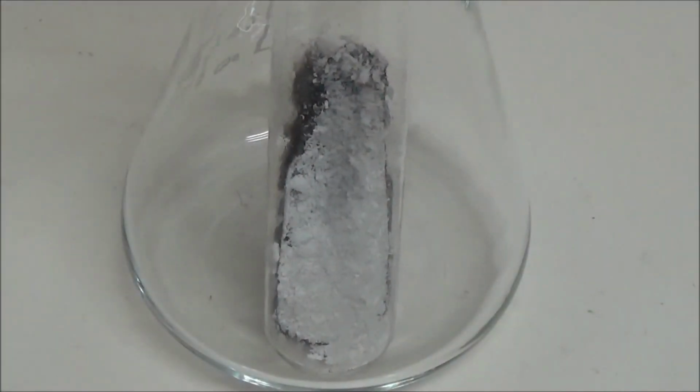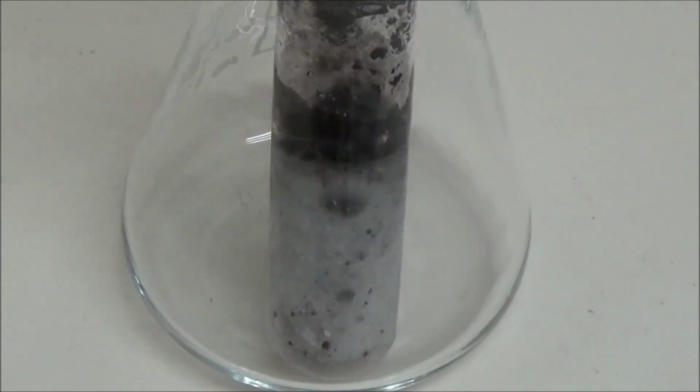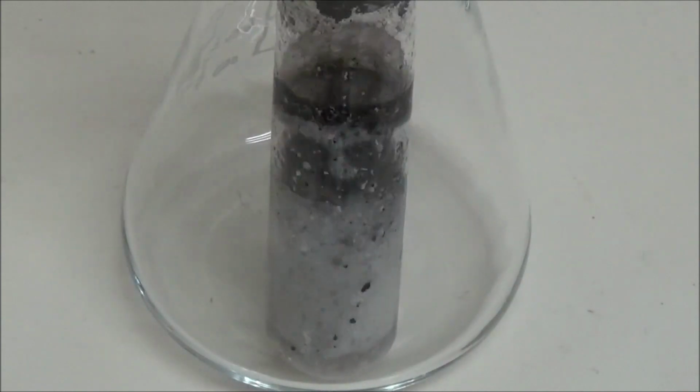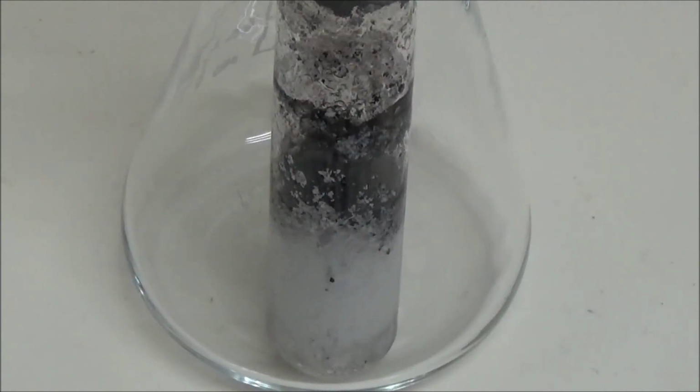For the second part of the proof that the decomposition actually took place as shown, we add some diluted hydrochloric acid to the white mass. This foams up a lot and releases carbon dioxide, evidence of carbonates.